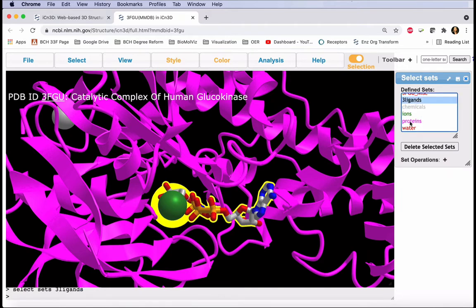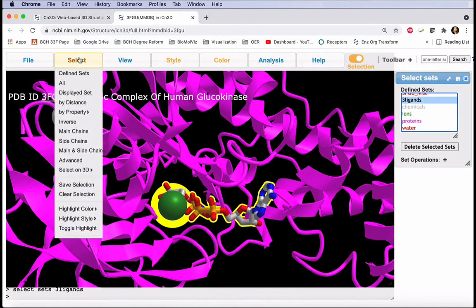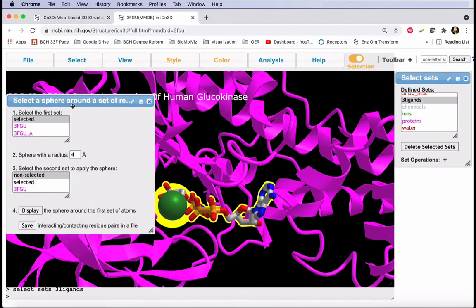Now with the ligands selected, we want to define a sphere of five angstroms around them. In the Select menu, Select by Distance, and in this pop-up menu we'll leave this as Selected since all of our ligands are selected. Adjust this to five angstroms and find the non-selected residues.